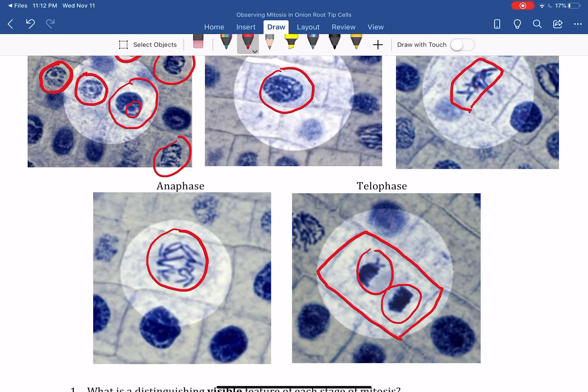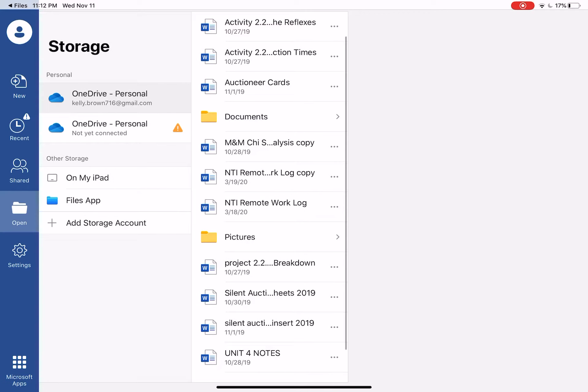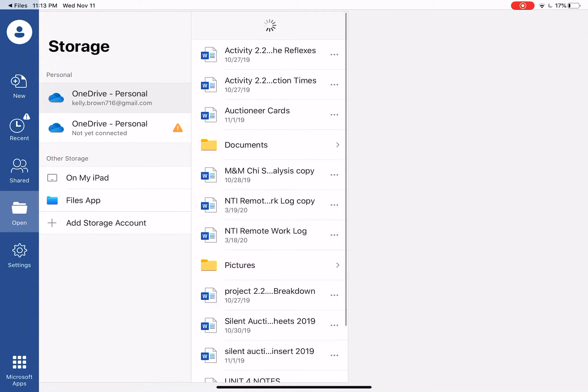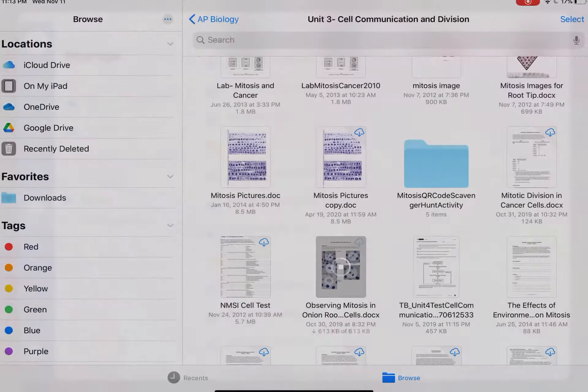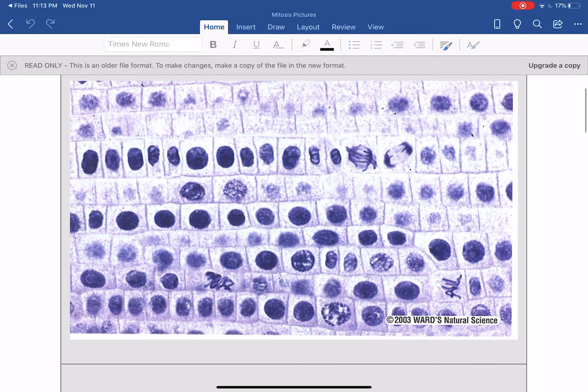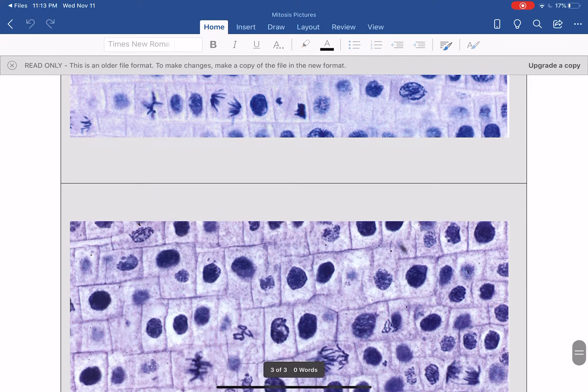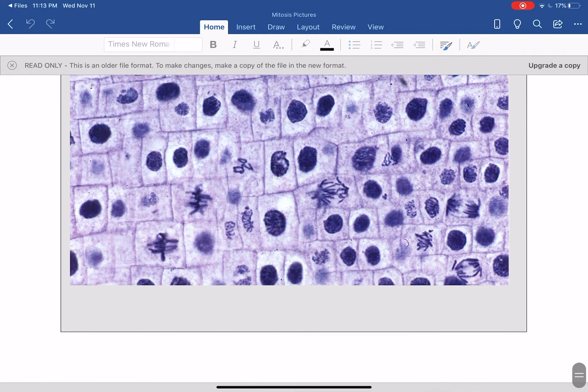So you will have some images of an onion root tip that you are going to use, images very similar to those that I just showed you. And you have to count 100 of them. So there's several cards here that you can do. It doesn't matter which cards you pick. You'll probably maybe want to get a scratch sheet of paper and kind of tally as you count.